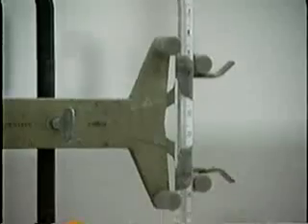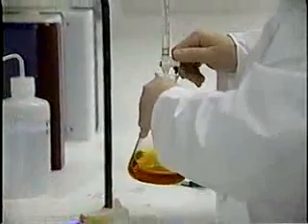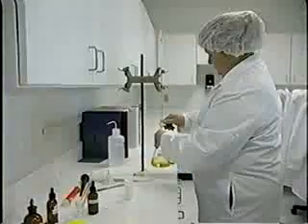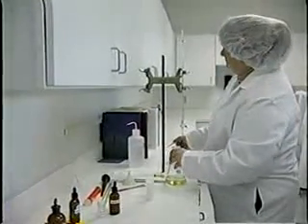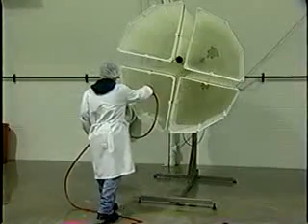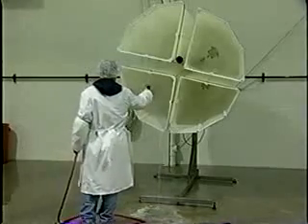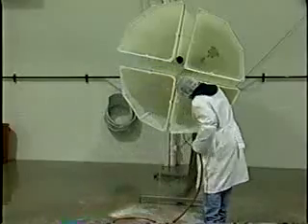Microbial testing may also be performed to monitor the hygiene and microbiological quality of in-process product, sprouts at different stages of growth, or irrigation waters, by testing for generic E. coli. Such monitoring activities are useful to identify trends in the quality of raw material and to assess the cleanliness, sanitation, and hygiene of the production environment. Results of such monitoring can be used to plan for improvements in effectiveness of quality and/or sanitation controls. Additional information is included in the accompanying handouts.